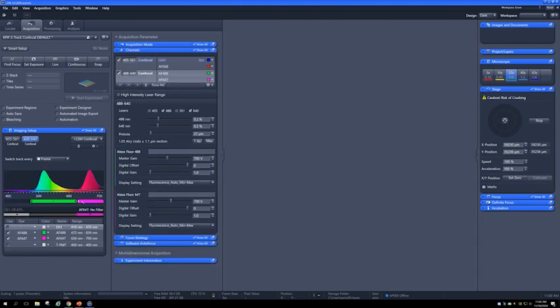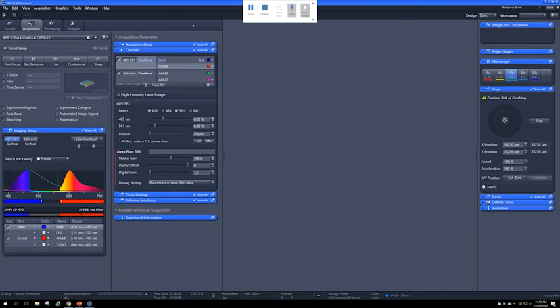If you are using the 640 laser, ensure that your collection window does not capture any laser light. For other tracks, it is okay if your window includes the laser light. You can also add the TPMT detector to collect a bright field image. When you are finished setting up your experiment, save your settings under a new name.